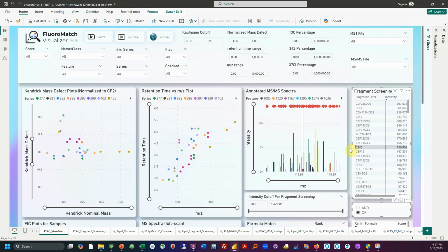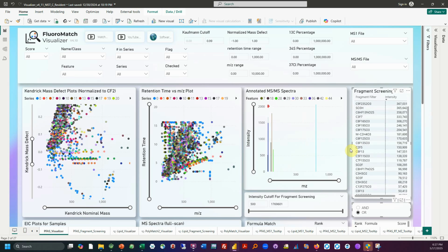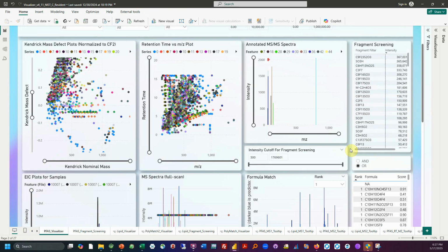What else do we have in our toolbox to find unknowns? Let's say we've done those 2 things, and we've identified an unknown, and we're still wanting to find more. Let's say it's a blood sample, and that's very important. We want to know everything that's in our blood, because that's what we're being exposed to. So we want to keep digging. And that's, of course, up to you and your project, how you're going to keep digging.